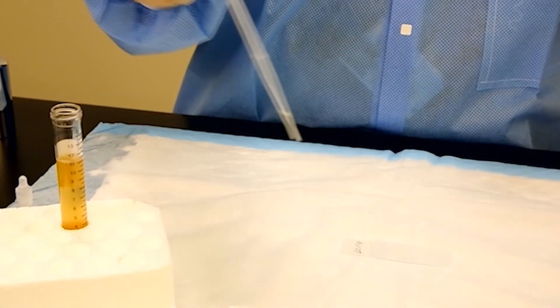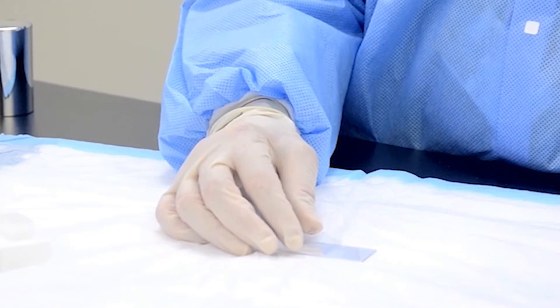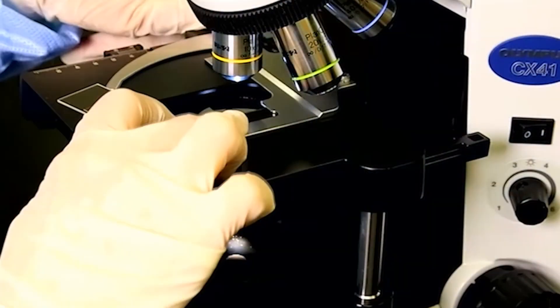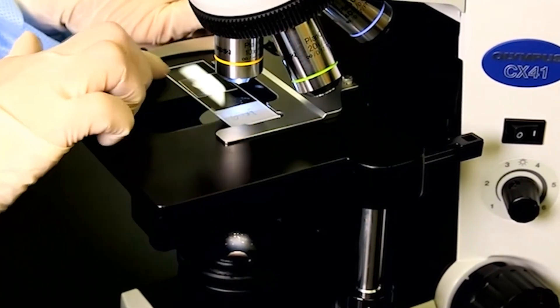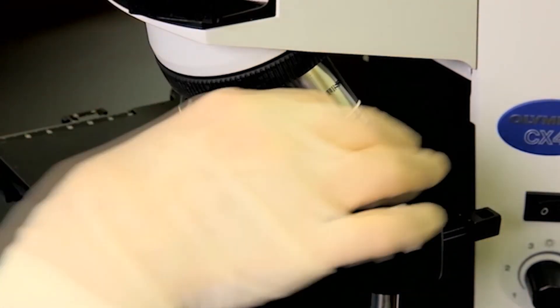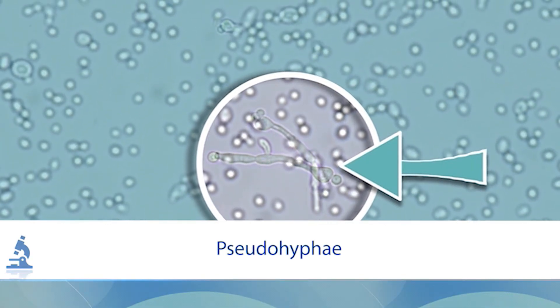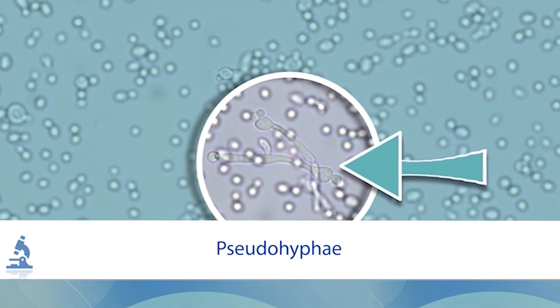To begin, transfer one drop — 10 microliters — of the specimen to a sterile labeled microscope slide. Without touching the specimen with the dropper tip, add one drop or 10 microliters of 10% KOH directly to the specimen on the slide. Carefully place a cover slip over the specimen-KOH solution. Using a bright field microscope, focus using the 10x objective and scan at least 10 fields. Use the 40x high power objective to identify morphologic characteristics. If yeast forms or pseudohyphae are seen, they can only be reported as yeast present, since identification of genus and species is not possible in a KOH preparation.